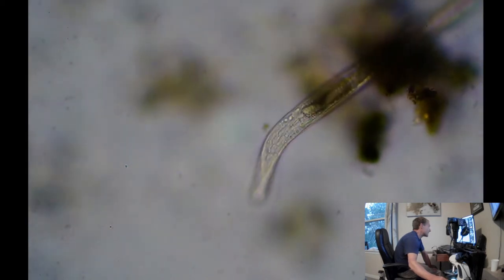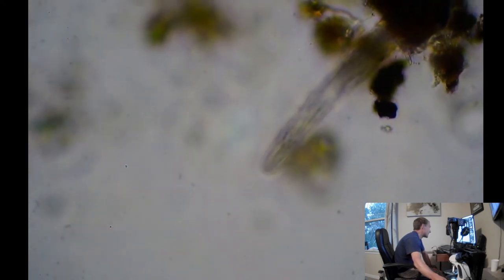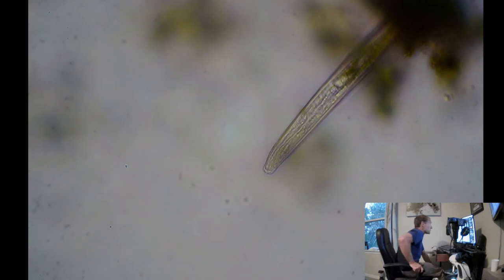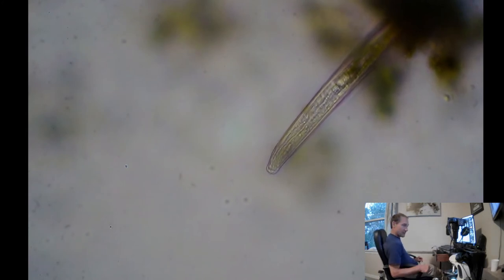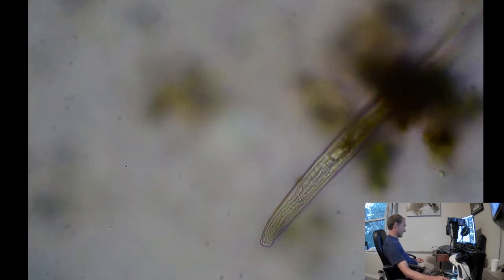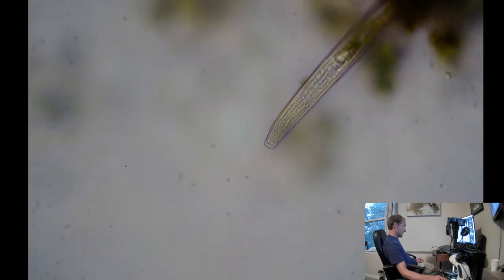Pretty wild looking. Not seeing that little, whoa. You just snap at something? Your mouth still look the same? My guess is that's a nematode that eats other nematodes, or a bacteria feeder. Not seeing any signs of the other types. But pretty neat.